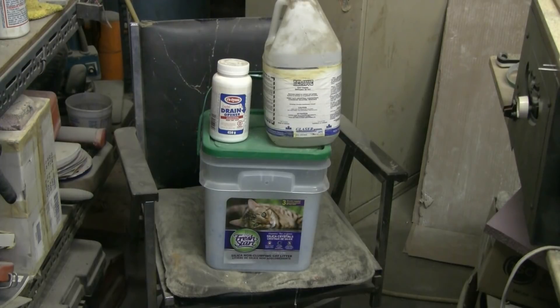What we can see here are the two ingredients we need. On the bottom we have silica gel in the form of silica gel cat litter, and on top of the cat litter bucket I've got two examples of sodium hydroxide, also commonly known as lye.